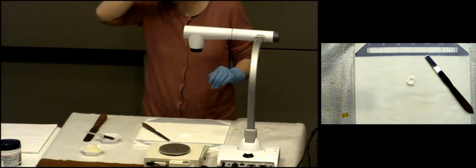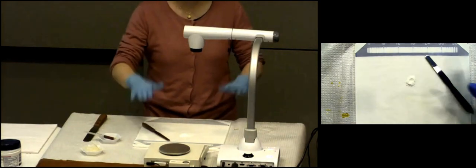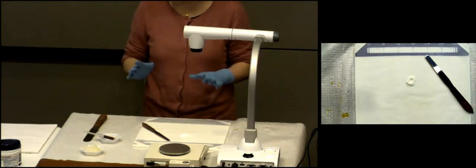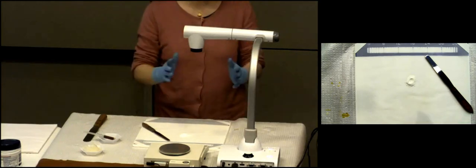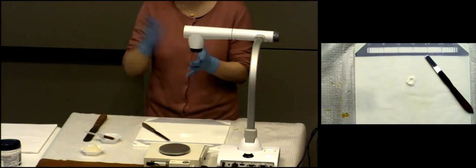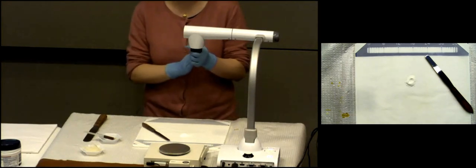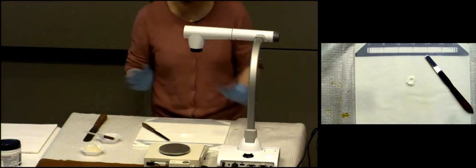That's it. However, last time, I probably did not emphasize enough that you have to tape 4 corners down really well, because if you were lazy and taped only 1 or 2 corners, you survived, that was fine, right? For today, please don't be lazy. Tape 4 corners down, because you're going to do a lot of activity, spatulation, on that whole piece of paper. Of course, we will tell you not to try to use the whole piece of paper, but you do a lot on that piece of paper. Therefore, don't be lazy, because you will find out it's really hard if one corner is not taped well. Okay? All right. So you know how to do it.